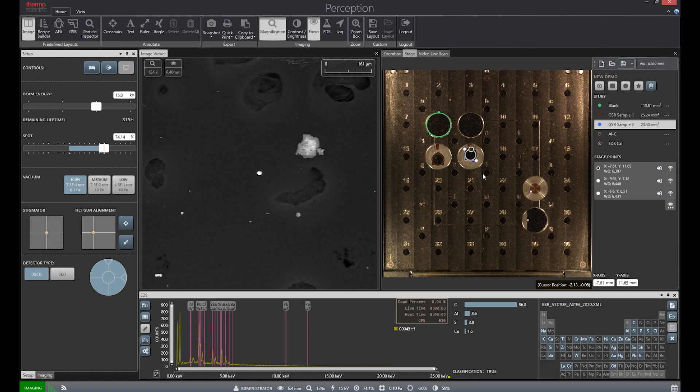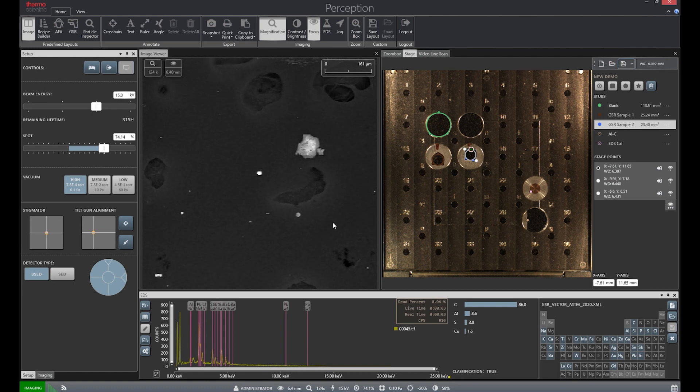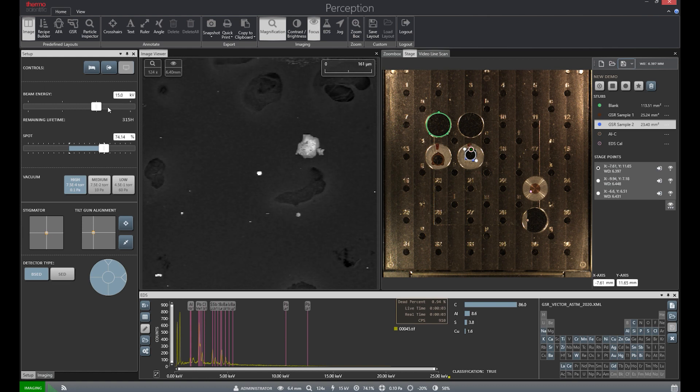The stage file tells the software where the GSR analysis will be conducted. To the left of the NavCam image is the SEM Live View, which will be used for adjusting our sample areas, which make up our stage file.